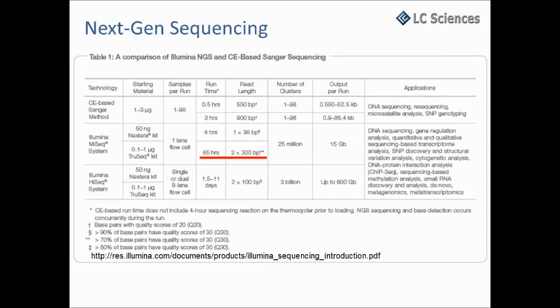We sequence a single sequence of 550 base pairs, or even up to 900 base pairs. But we were limited in our sequencing to one or maybe 96 wells, 96 tubes. But with Illumina's MiSeq system, we can get like 25 million reads. So if we calculate this, we can handle a lot of samples.